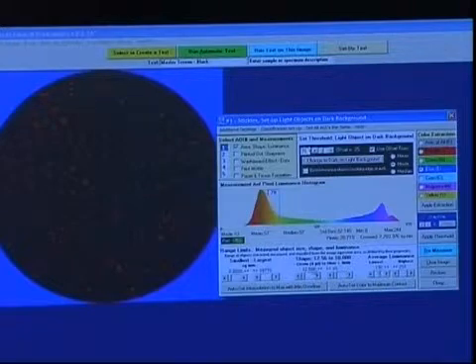Very easy. You can see the image is bimodal. There's an awful lot of things in this image. This peak is probably the white stickies, and these are the hairy stickies down here. But we're setting up stickies in the first AOI. We'll set the minimum size to be 0.08 and above. The shape we're looking for is those that are round, between 12.57 and 45. The scroll bars control this very carefully and very easily.